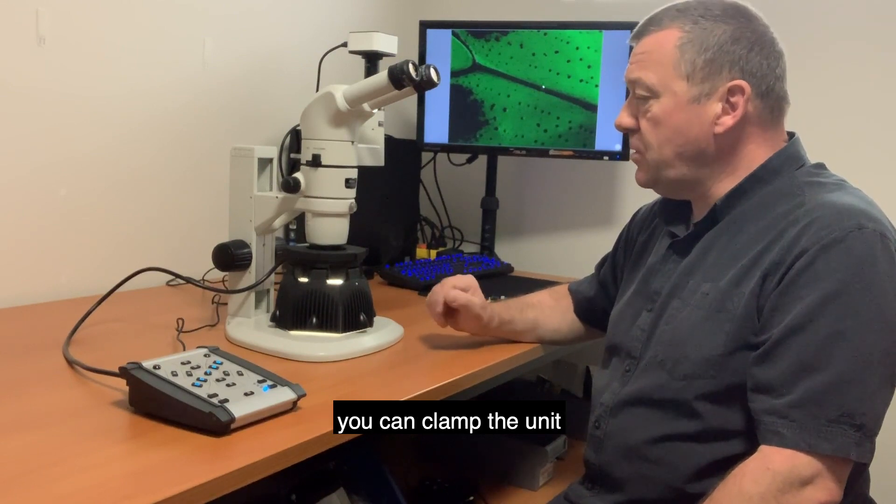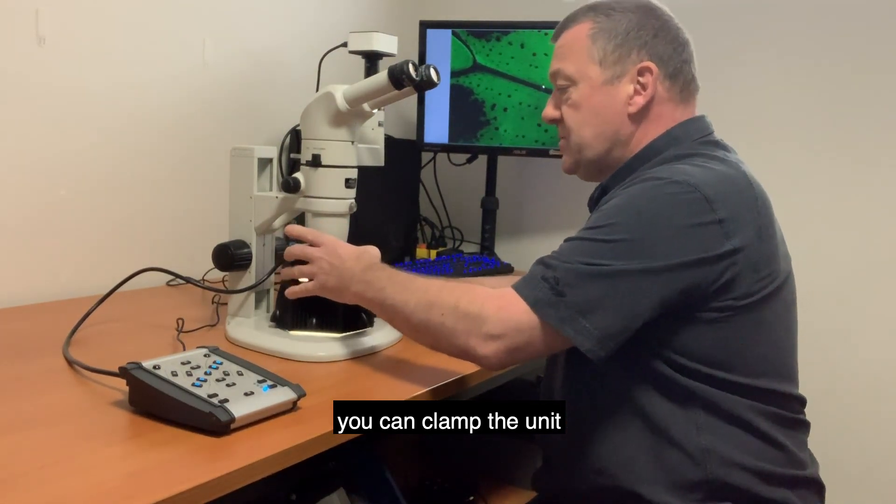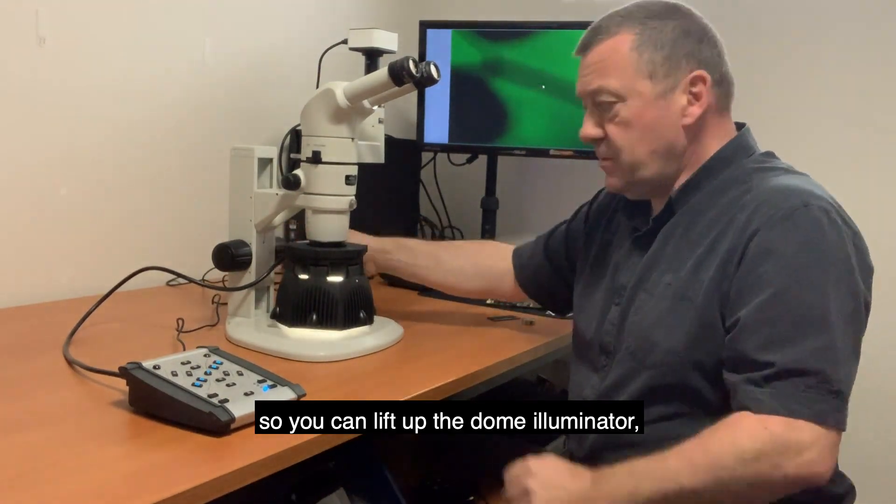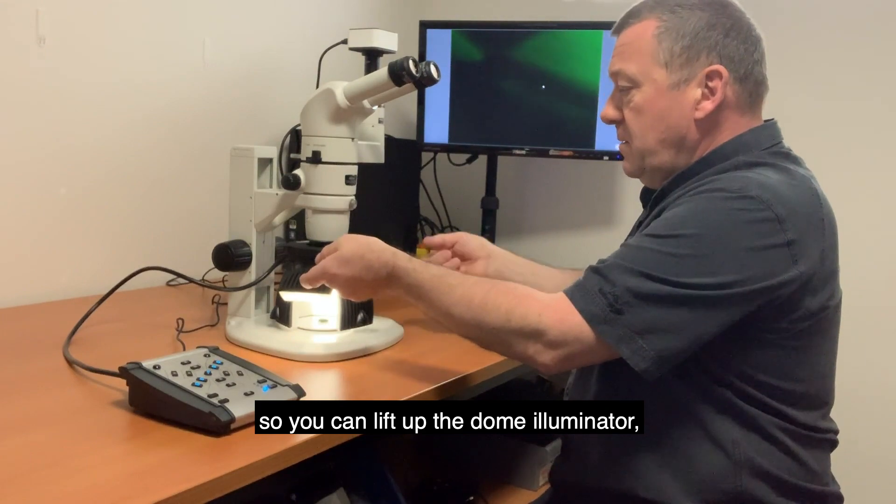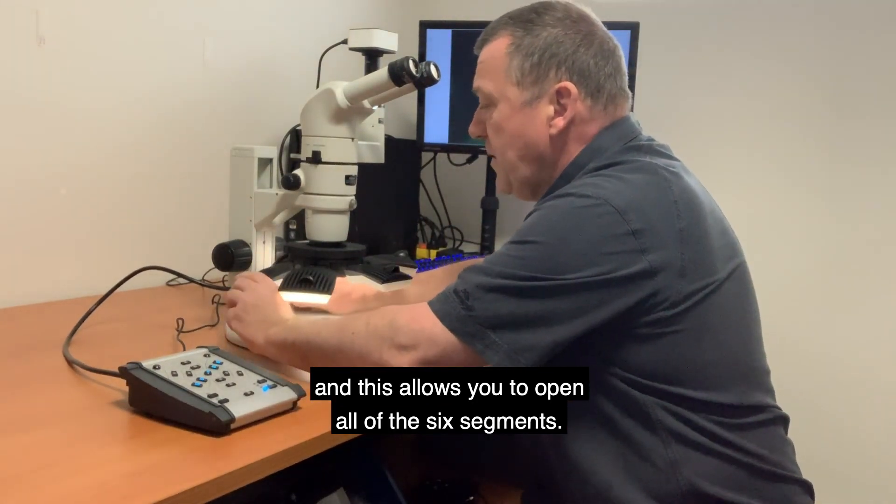You can clamp the unit to the optical head, so you can lift up the dome illuminator and this allows you to open all of the six segments.